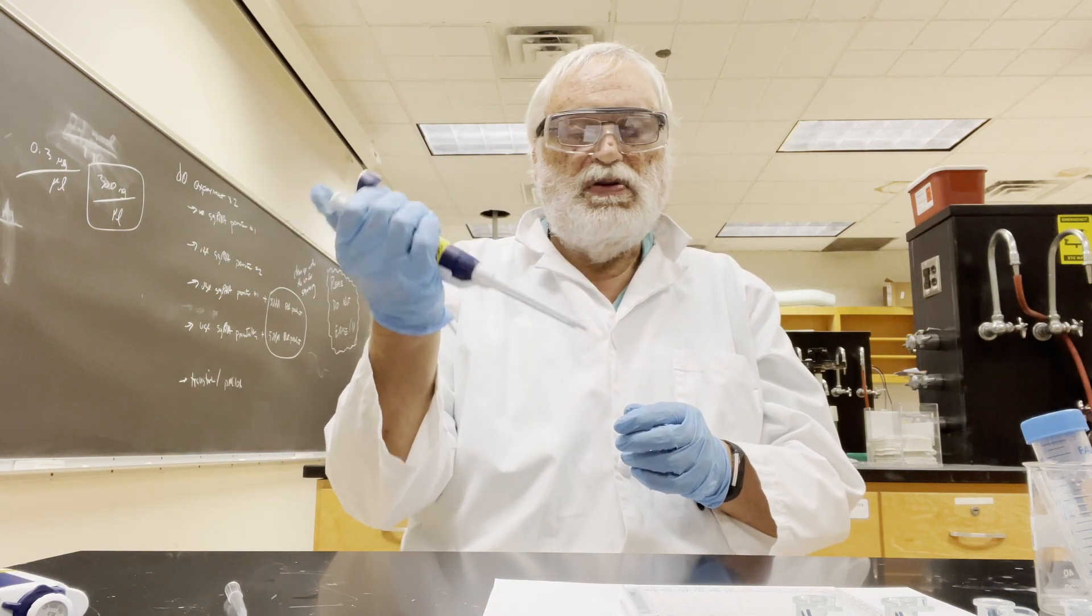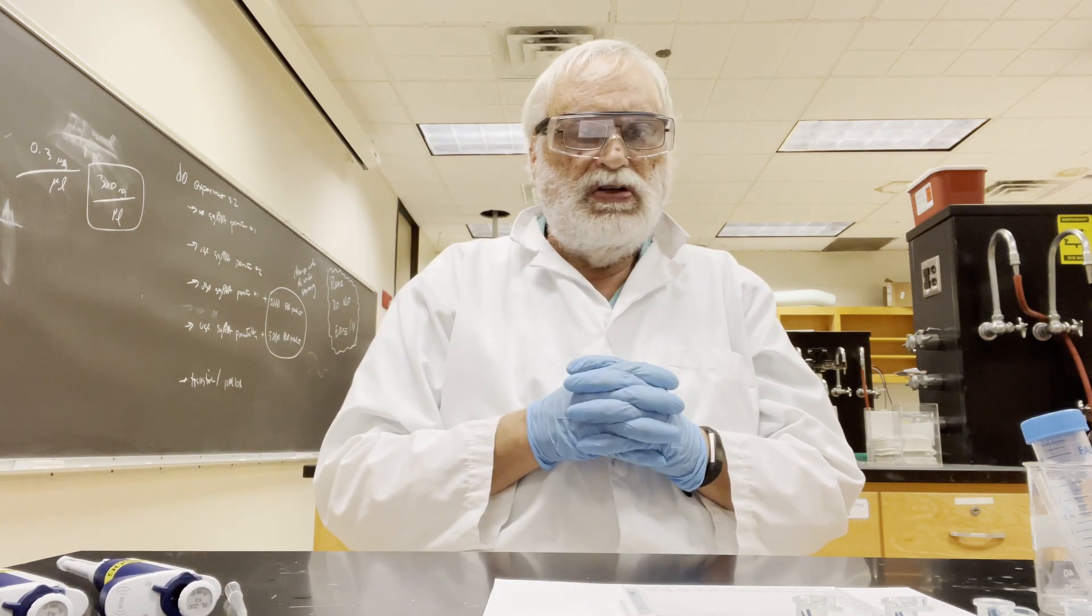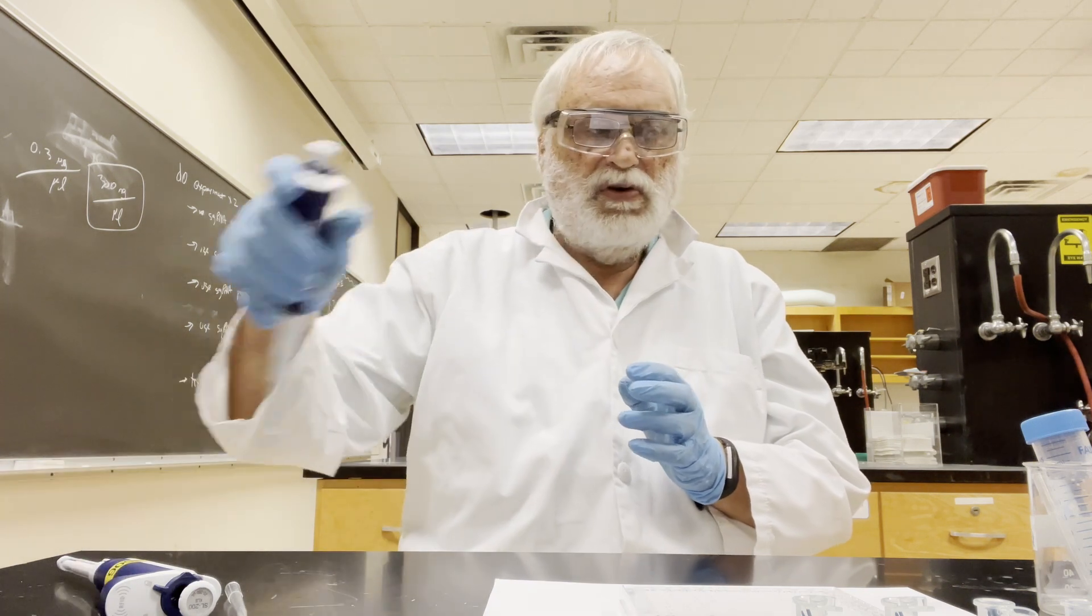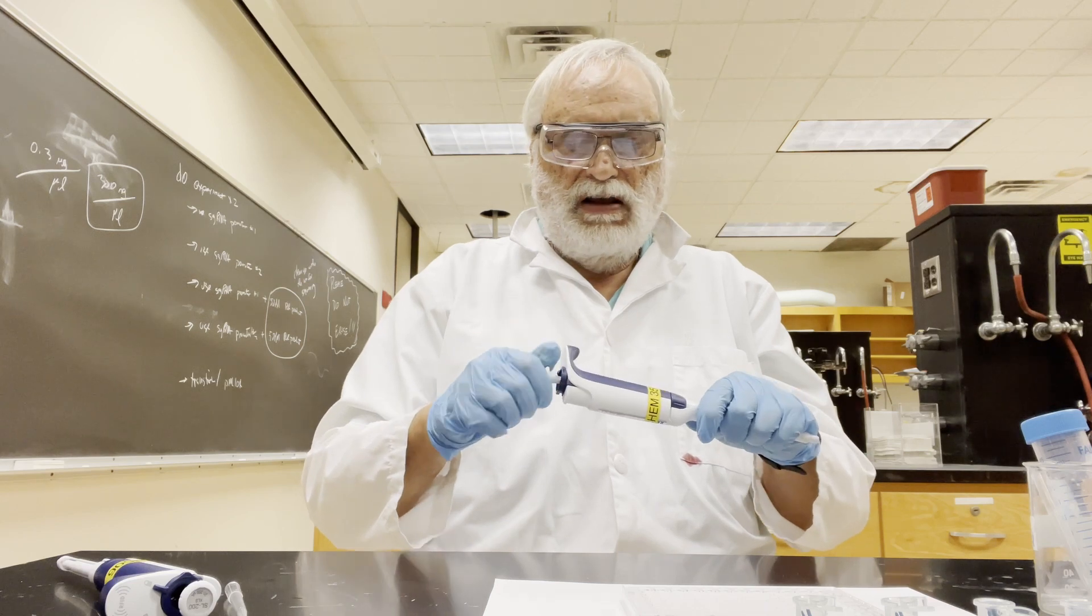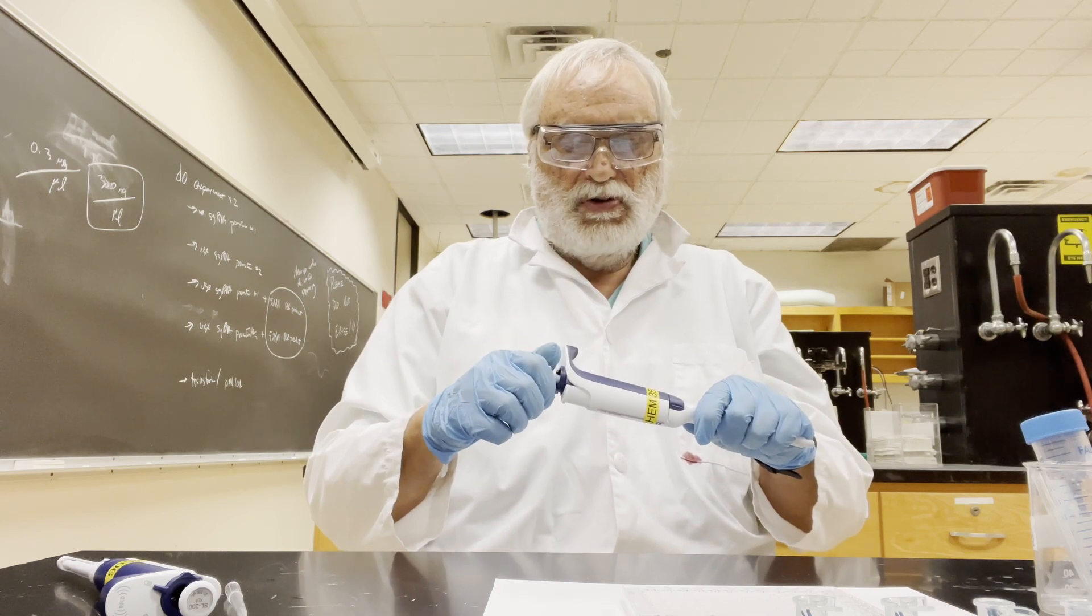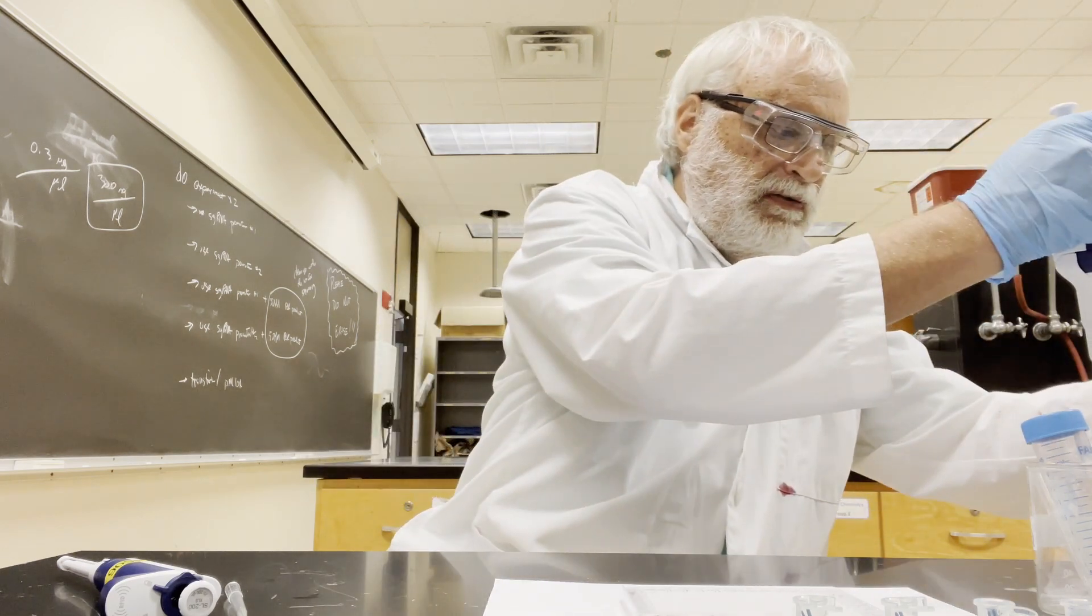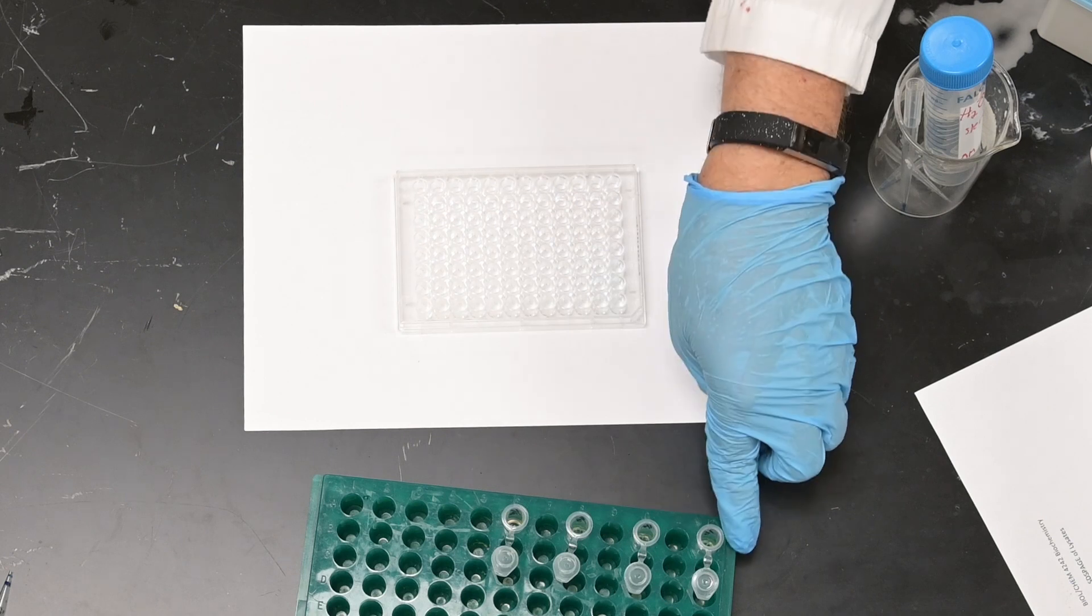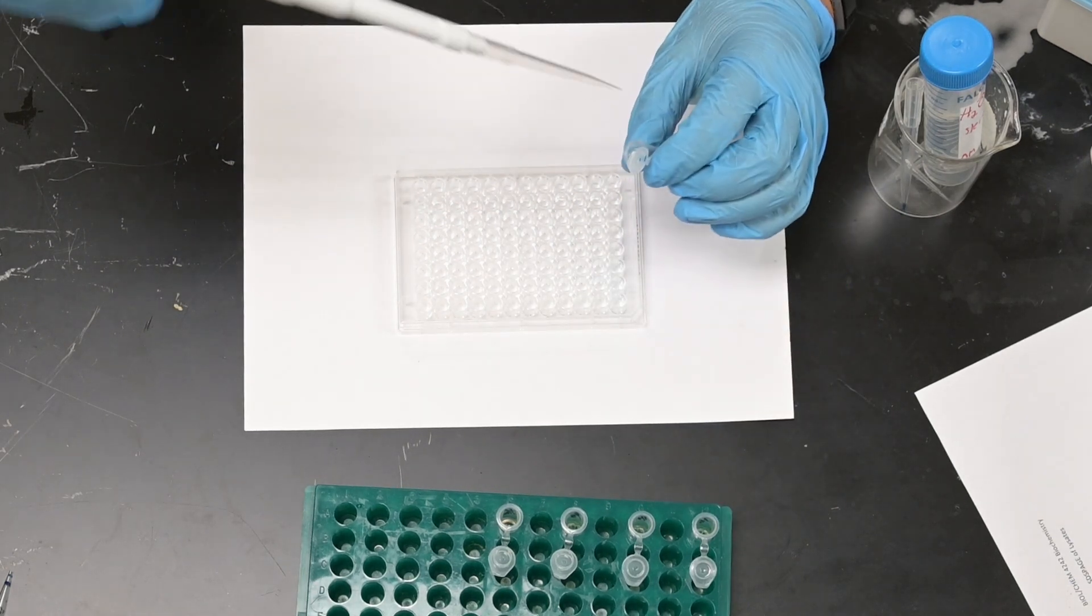The first experiment we're going to do is show you how to do dilutions on a microplate. What the protocol has is you take three tenths of a milliliter of one percent blue dextran.